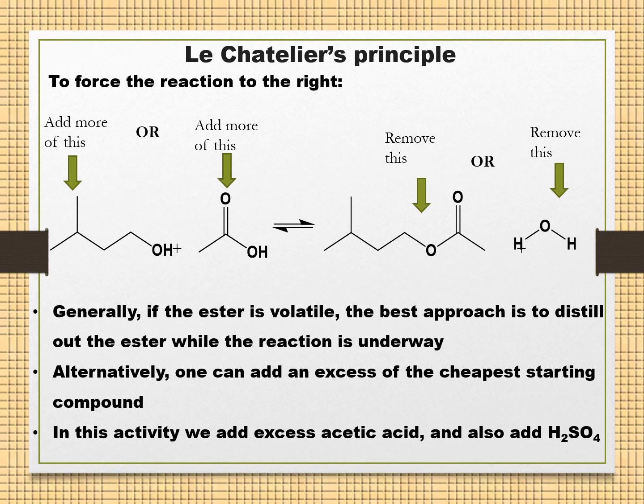So if you choose to play with the reactants, like we said before, you can add one of the reactants. In this case, you can take the opportunity to add which one is appropriate to add. Having that these reactants have similar opportunity to be added, you can choose to add the acid instead of the alcohol, simply for cost purposes.